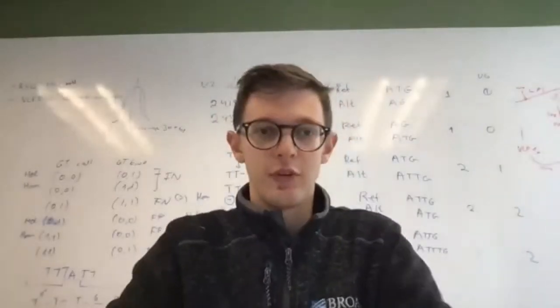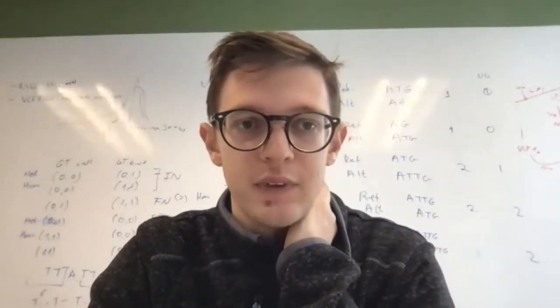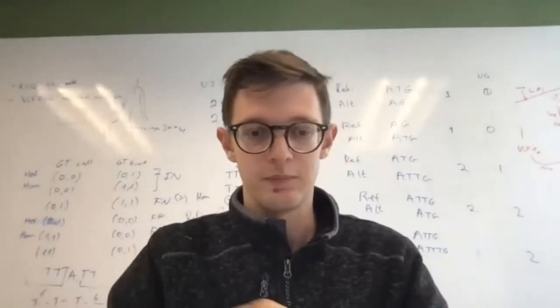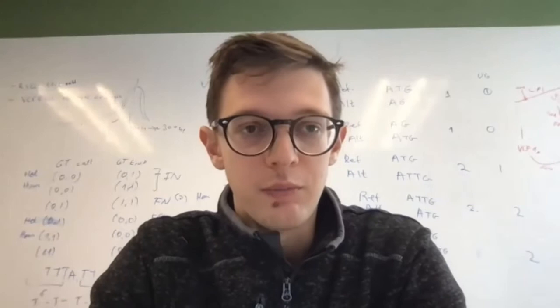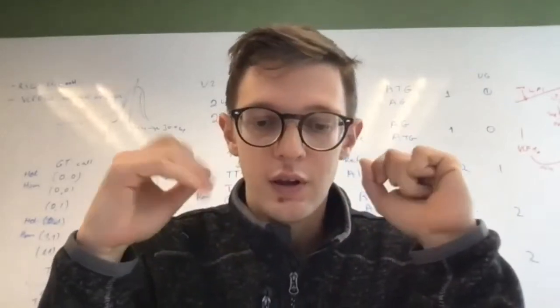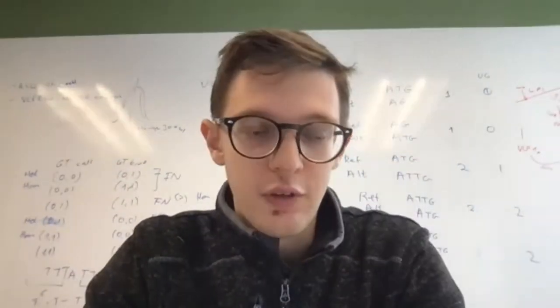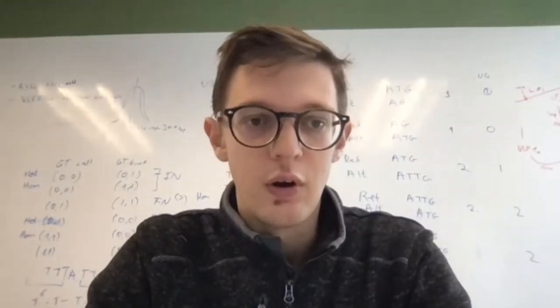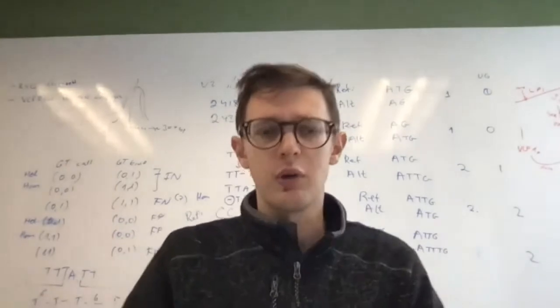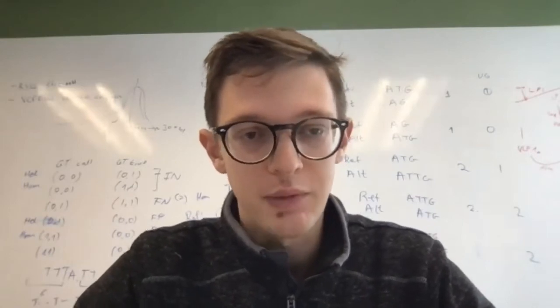Yeah, I can take that. So the benchmarking was done using the masked version of the HG38 reference. I know that Illumina was planning to publish some documentation about the mask. The masking is dealing with some mapping improvements in the alt context and the decoy context of the HG38 reference genome, to my understanding. I know that Illumina was planning to provide some more blog posts, I think, about that masked reference. Heidi, do you know if there's any updates on that?